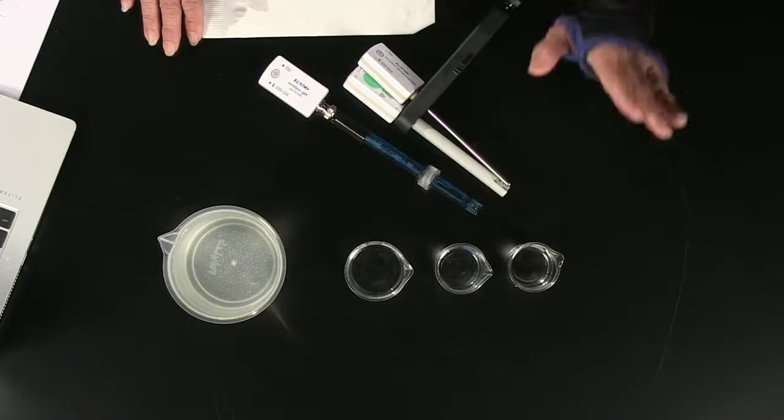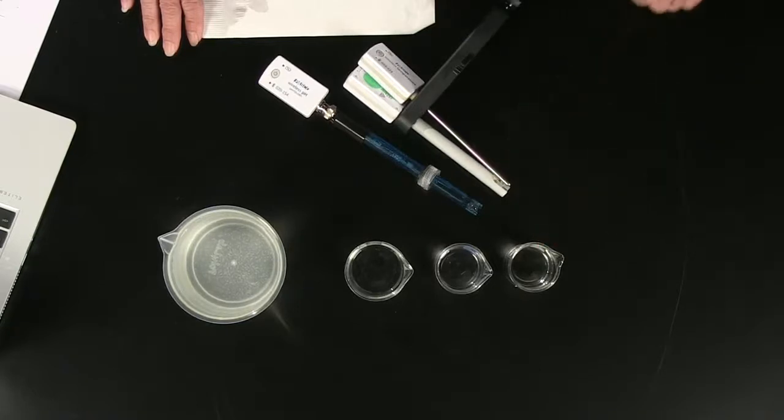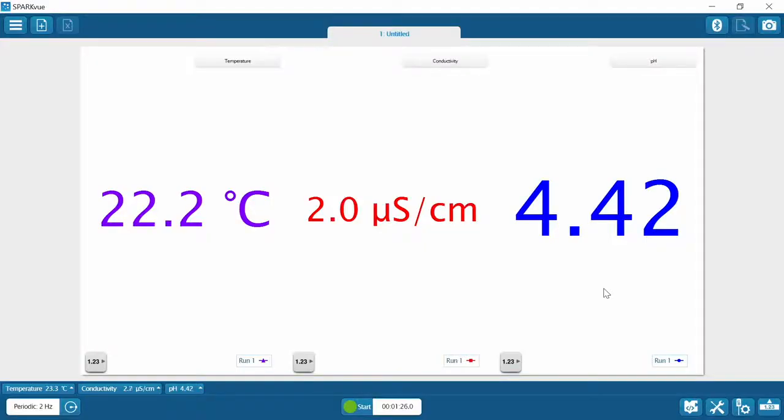Now, if you recall, in the original lab, the color pink or magenta came out, and that was our signal that a chemical reaction happened. We're going to take that same experiment and see what actually happens in terms of the quantitative results. So for that, we're going to be using these sensors. First, let us take measurements, and you will find this in one of your config files where you can actually find a setup that's already ready to measure your temperature, your conductivity, and your pH.